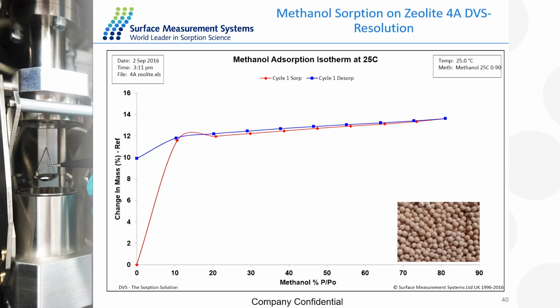When we are looking at this material, we are looking at the material in its dry form. It's been stored under vacuum, has been perfectly dry, and then we do the full experiment under nitrogen. Those are defined as the ideal conditions, the perfect conditions in which this material can perform with a higher capacity of absorption. However, whenever we purchase the material from a provider, it's not provided under vacuum, it's not provided in activated form. A certain amount of water will be trapped inside the material. So we also wanted to simulate the difference in the uptake of this material when it is exposed to water.